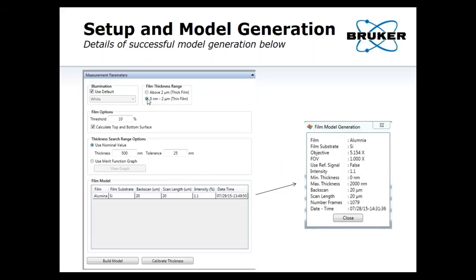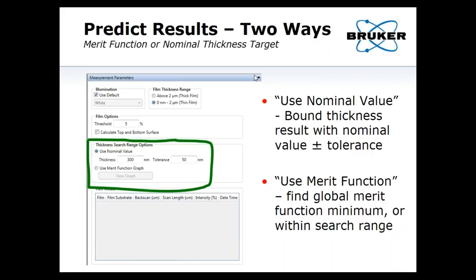Once you've generated the model, this is the GUI when thin film mode is enabled. You'll have setup options and your models displayed — only models relevant to the optics you currently have selected will be shown, so you can't accidentally make a measurement with the wrong model. Once you do your measurement, you have two ways to interpret the data: you can enter a nominal value plus or minus a tolerance, or allow the merit function to find the global minima automatically. The first is for when you know roughly what the thickness should be; the second is more exploratory.